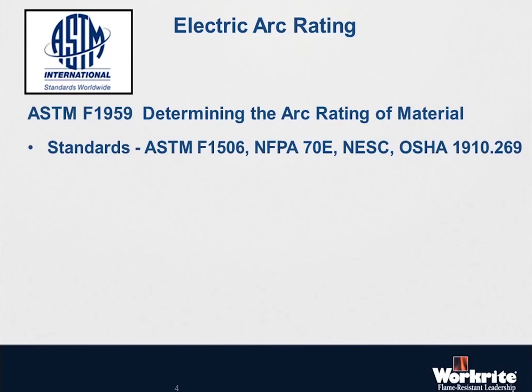70E references back to the ASTM F1506 as the standard measurement for the materials, but NFPA 70E does require an arc rating, as does the NESC, National Electrical Safety Code, and the OSHA 1910-269. They all require that the fabrics used in the protective garments have an arc rating, and ASTM F1959 is the test method that's used to determine the arc rating. So I'm going to run a little video that shows an arc test being run.